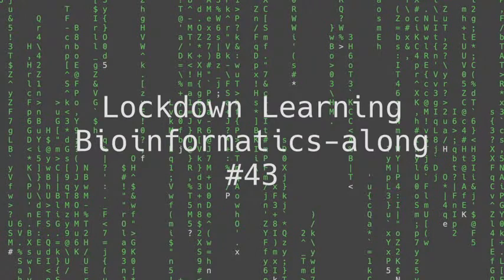is because that's the first stage process for an awful lot of other things that we could do later, for want of a better word, bioinformatics workflows that we could undertake next. So short read alignment is required as a first step for an awful lot of bioinformatics. So wherever we want to go next, short read alignment seems like a sensible first step. So that's where we're going to begin today. That's what we're going to talk about today.